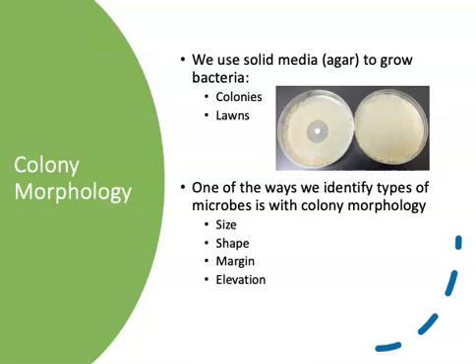We use solid media to grow bacteria in addition to other types of media, and depending upon the material that we use to inoculate that solid media, sometimes they will grow as colonies, and sometimes the bacteria will grow as what we call lawns. It all depends upon the starting concentration of the broth culture that we use to inoculate the agar plate. Take a look at this image right here on the slide.